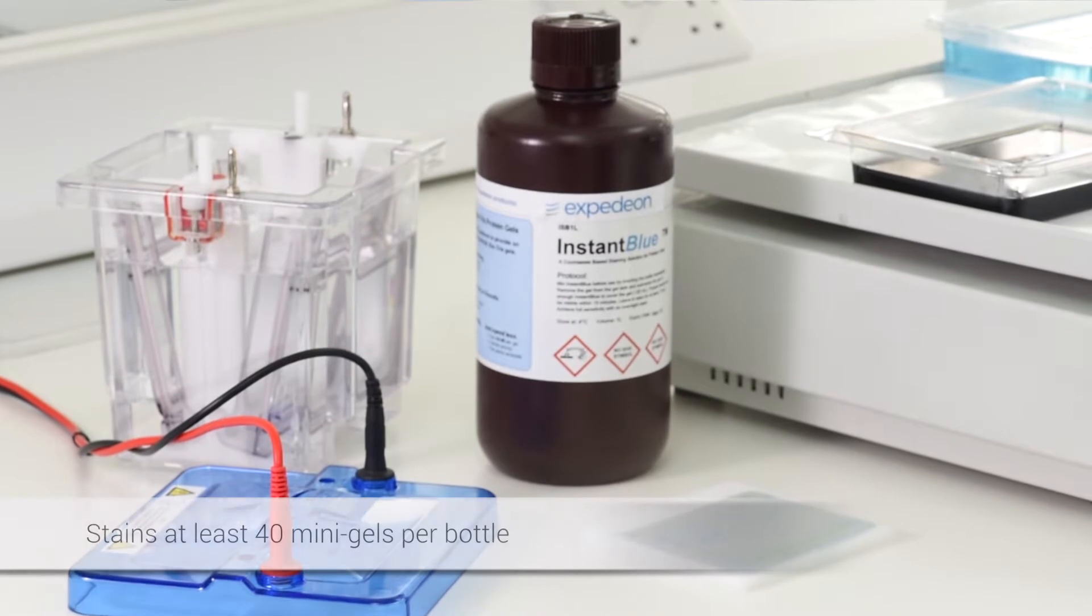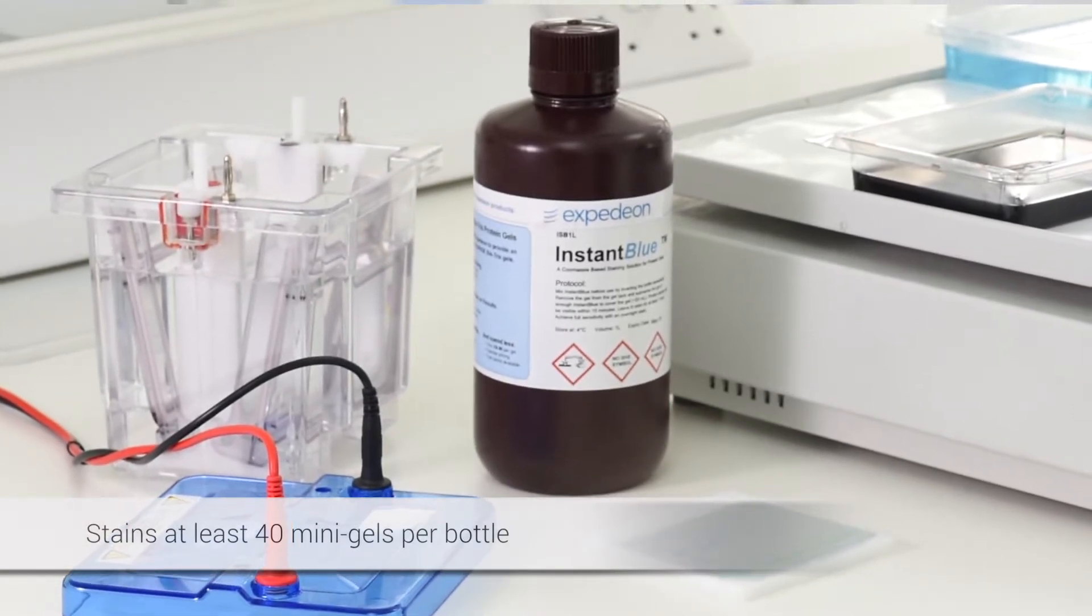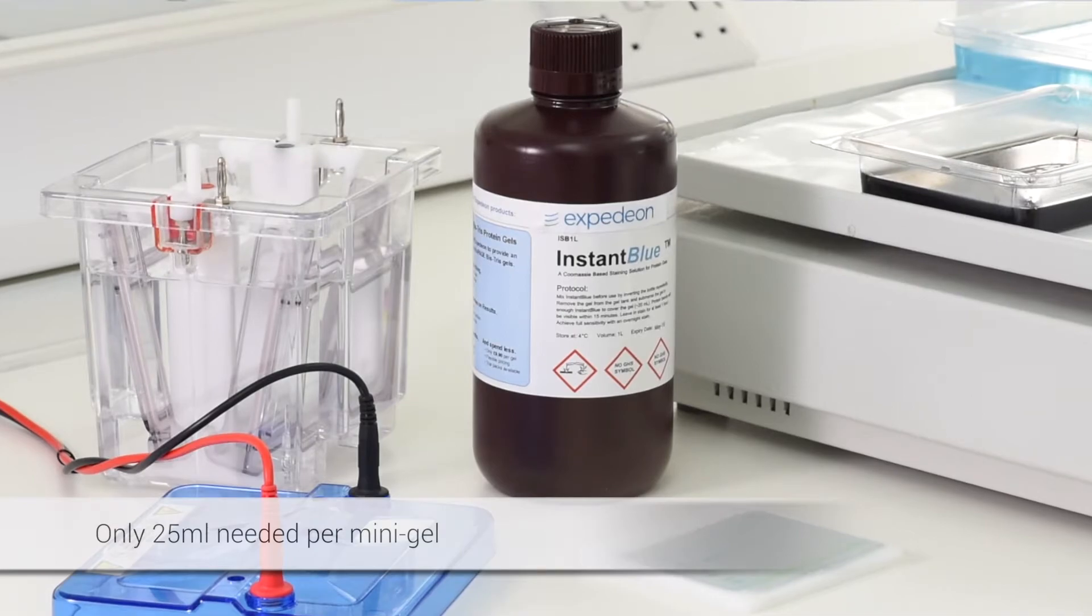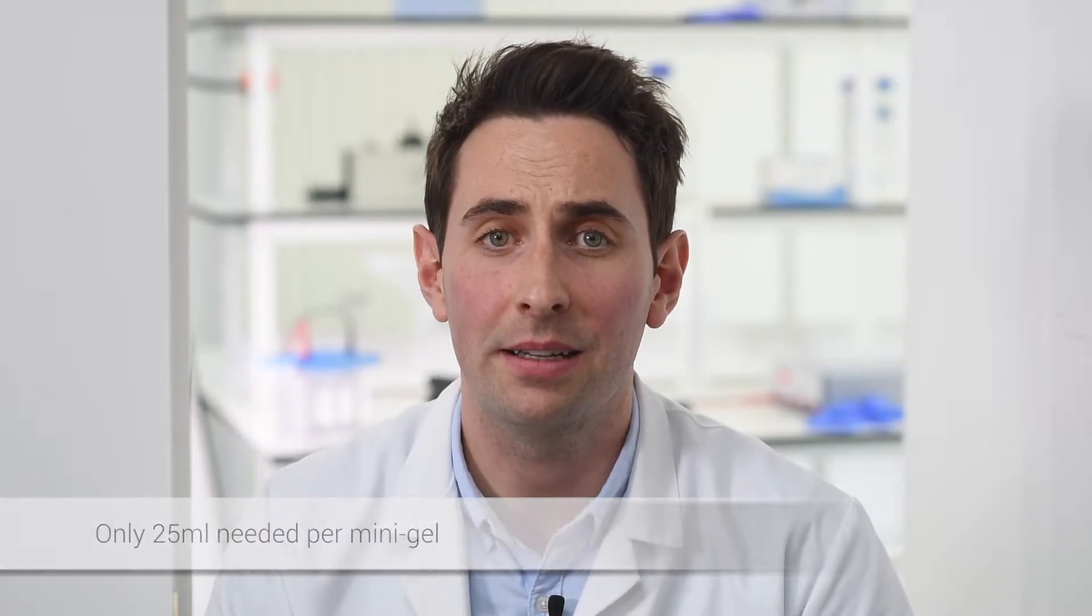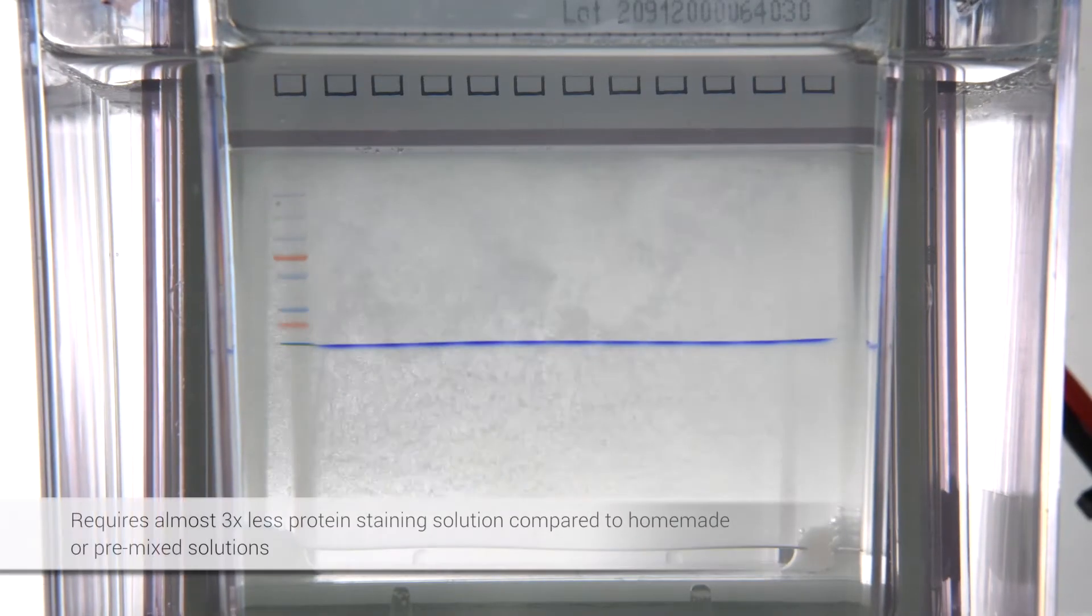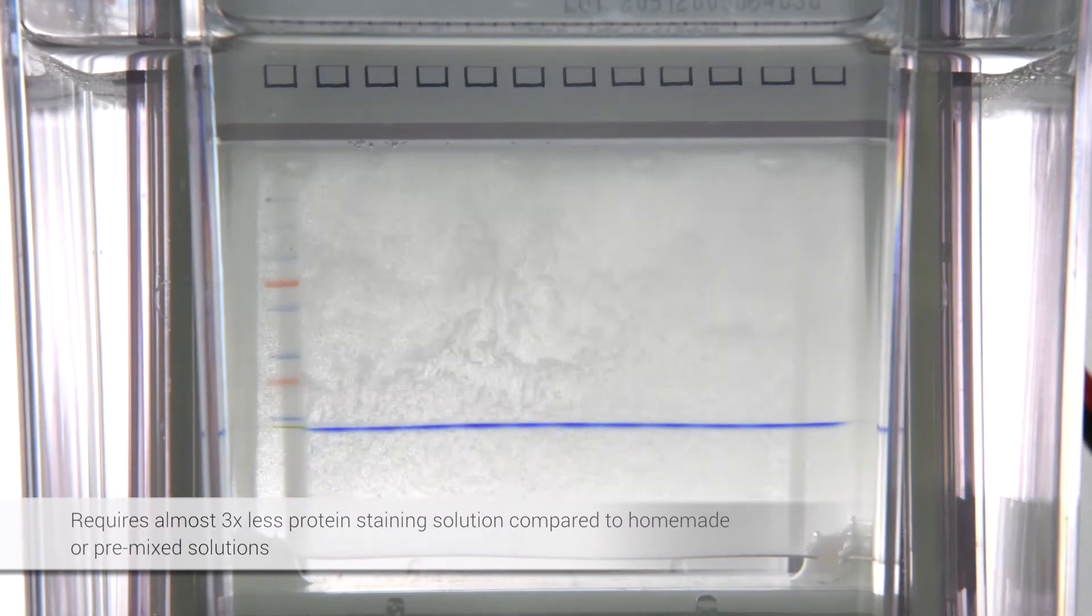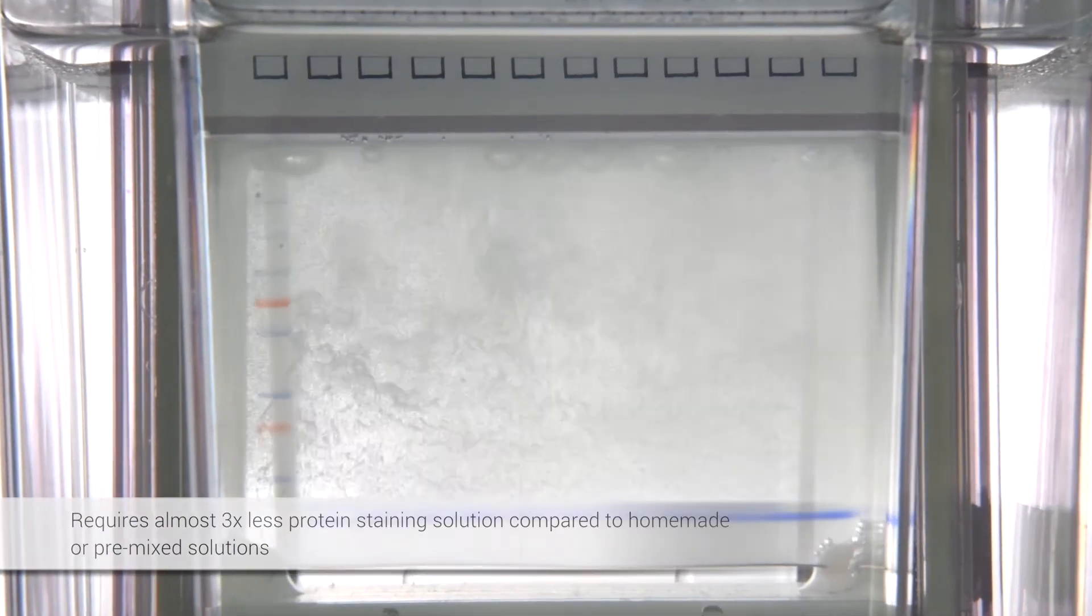InstantBlue is great value for money as it will stain at least 40 mini gels per bottle, giving you the ultimate staining power with only 25 milliliters per mini gel. This means you require almost 3 times less protein staining solution compared to homemade or pre-mixed solutions.